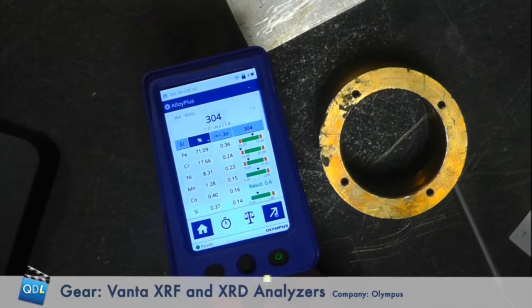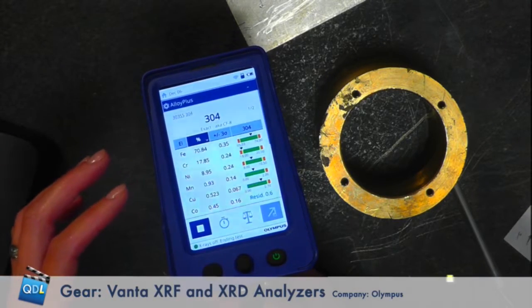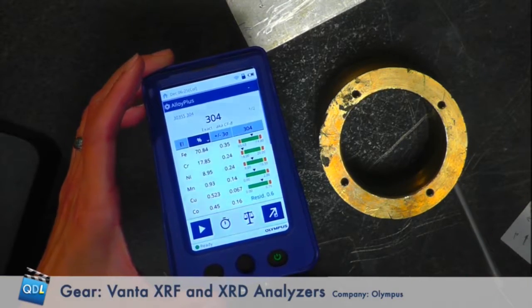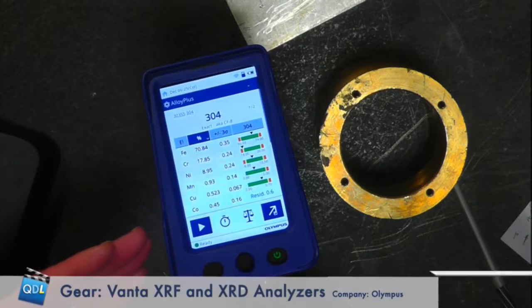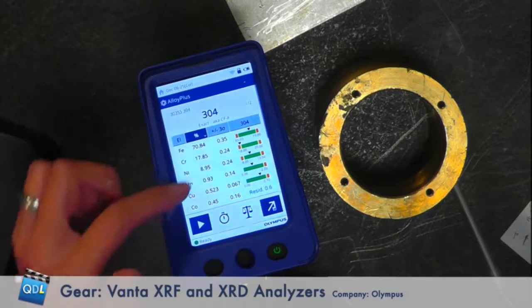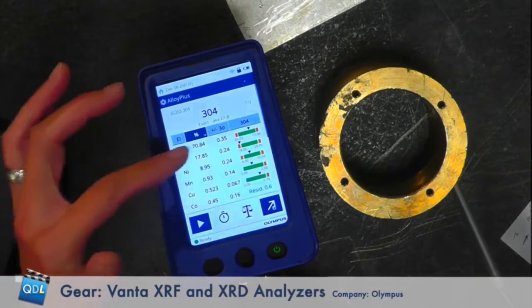We pull the trigger with the unit placed right down on the sample, as close as you can get. The analyzer comes back identifying what the alloy actually is. It obtains the chemistry from the sample — the element and its concentration — and then tries to match it against a library of known alloys. We have industry standards for over 750 alloys in the analyzer. There's a graphical, color-coded display: green means you're within industry spec for that element, yellow means within spec within the margin of error, and red means you're out of spec.